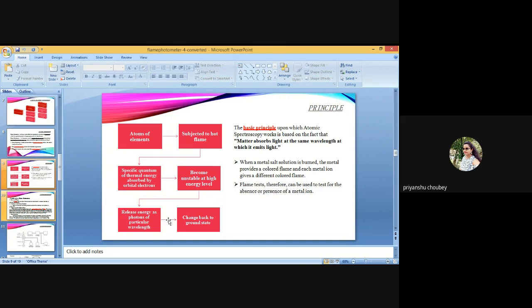Since the actual operation differs for the various types of ICP spectrometers with the type and make of computer software of the instrument, the reader is advised to consult the operation manual provided by the manufacturer of the instrument. The manufacturers and dealers may also provide required operational training to the user.